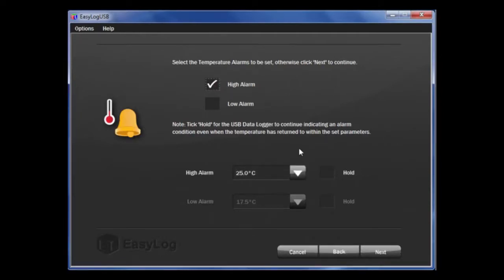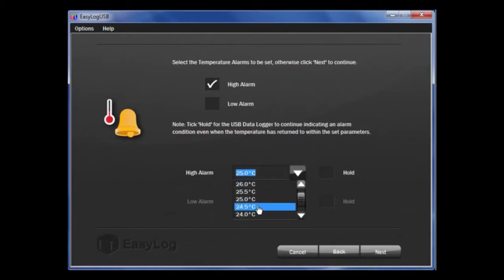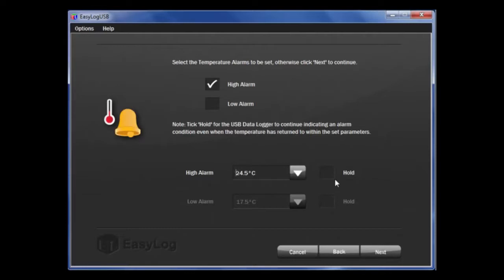Using the scroll down button here, choose the appropriate value. You will note to the right hand side that there is a tick box saying Hold. This is a feature that will continue to show an alarm condition even if the temperature has returned to a normal condition.